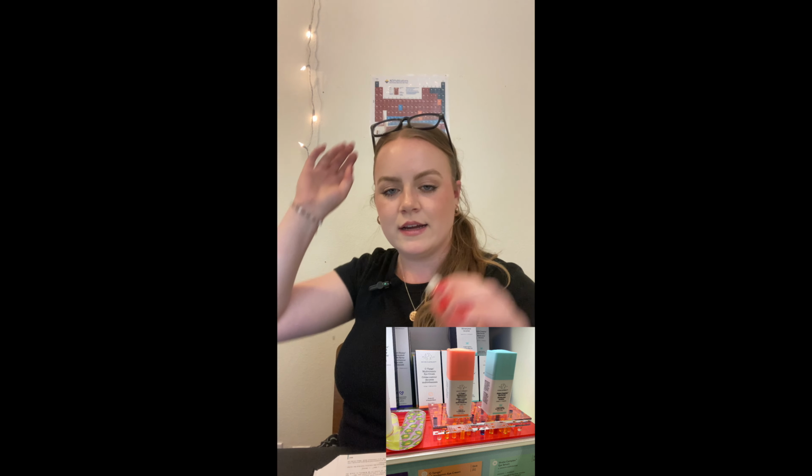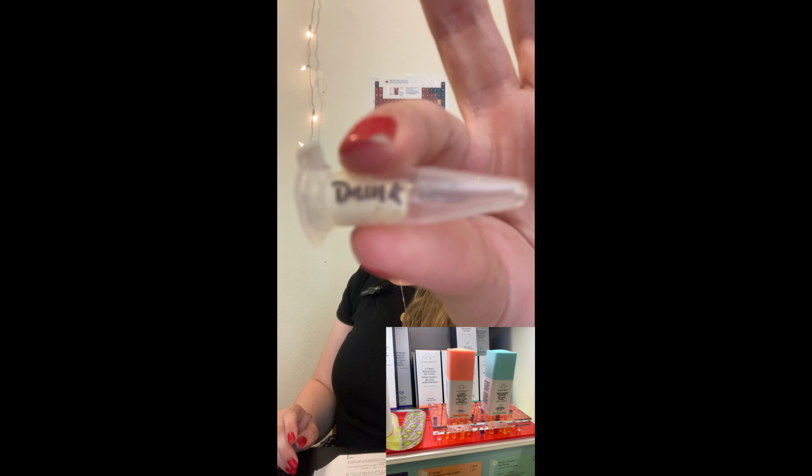Then I have the Drunk Elephant C-Tango Multivitamin Eye Cream. This one has several forms of vitamin C in it, which I found very interesting. It has sodium ascorbyl phosphate, magnesium ascorbyl phosphate, tetrahexyldecyl ascorbate, ascorbyl glucoside, and ascorbyl palmitate. Those are all really fun molecules, which I'll put up here. And here is what the sample looks like. I just wrote drunk for Drunk Elephant on it.